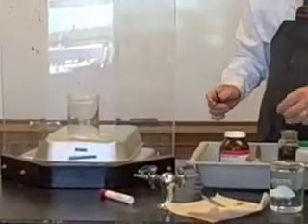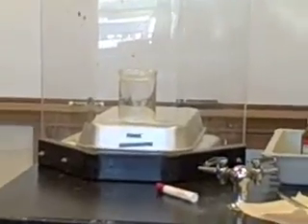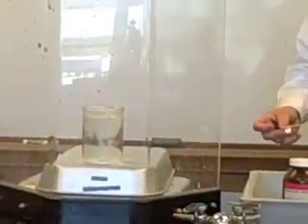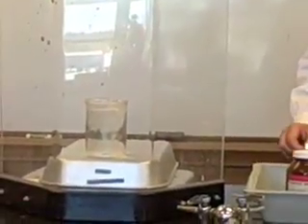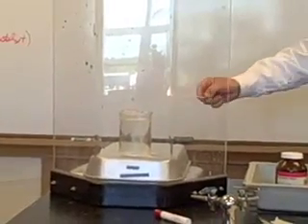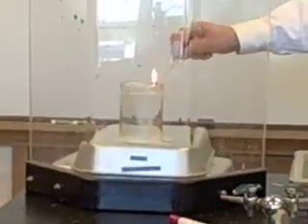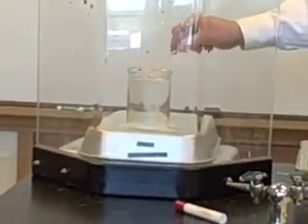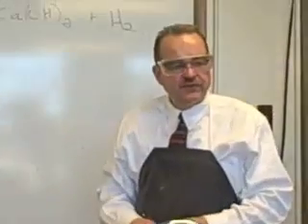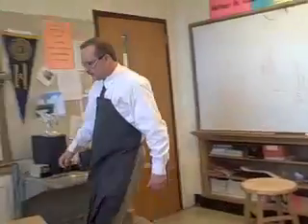Would you say that's more or less reactive than the calcium was? A little less. Similar, isn't it? The bubbles, once again, burn. It looks to me like the bubbles are coming off maybe a little faster. Would you agree? So we're seeing maybe an increase in activity.